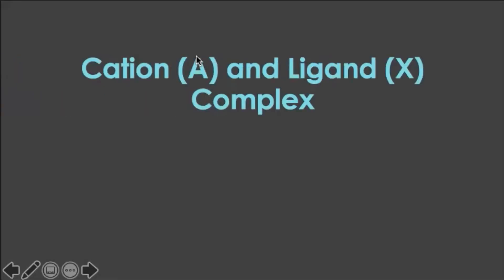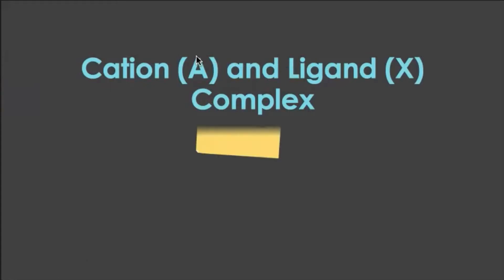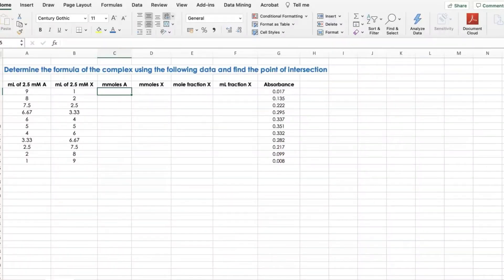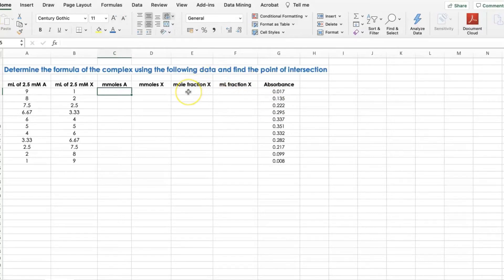Let's try an example for the formation of cation A and ligand X complex and solve the problem using Excel. Determine the formula of the complex using the following data and find the point of intersection. As you can see, the volume, concentration, and absorbance of each solution are already given. From here, we can calculate the mole fraction or volume fraction of the ligand. Let's start by getting the mole fractions — first, let's calculate the number of moles of both A and X.